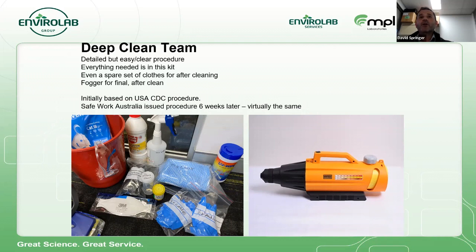So we had measuring cylinders in there so they could measure out exactly how much bleach to use and whatnot. We just figured that, look, this is our business. We're chemists, we're all scientists. We know what is best, and we will do a better job at cleaning.